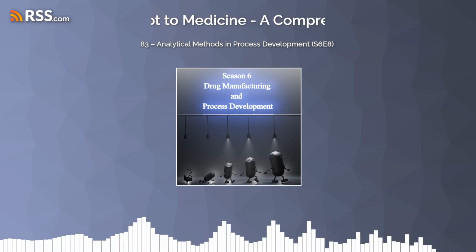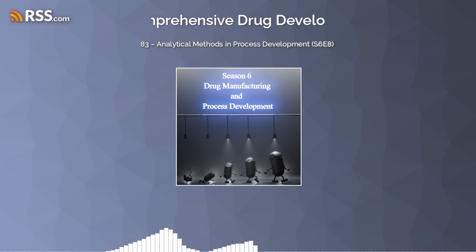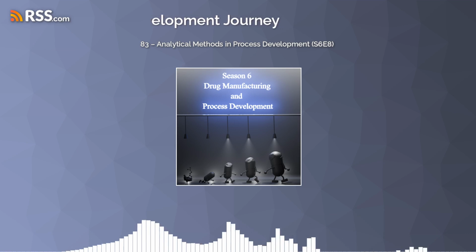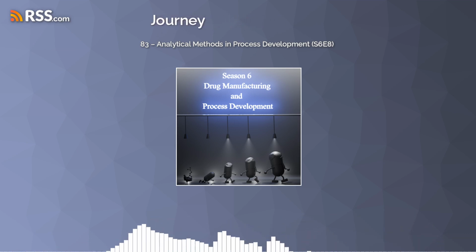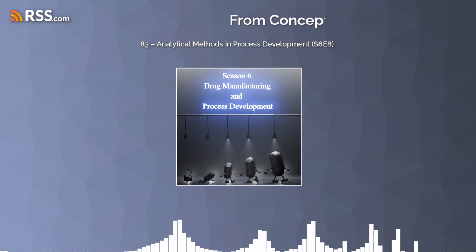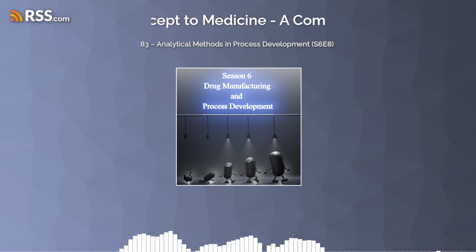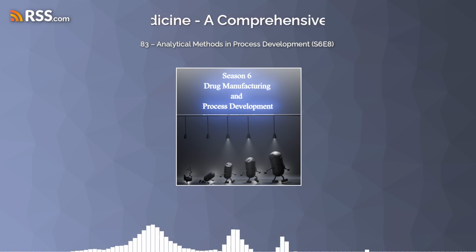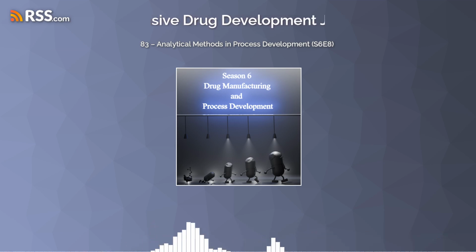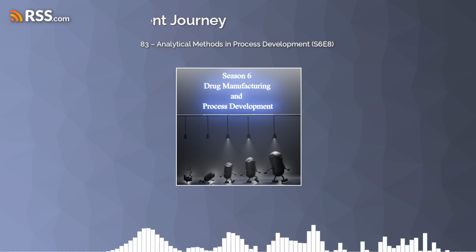molecular level. So you have a liquid sample from your reaction, and you force it through a column packed with these tiny, tiny particles. Okay. And the different molecules in the sample interact with those particles to different degrees based on their chemical properties. Some stick around a bit longer, some pass through more quickly, and as they exit the column at different times, they're detected and we can quantify them. So this separation lets scientists see what's in their reaction mixture: what are we starting with, what's our product, and anything else that might be in there.